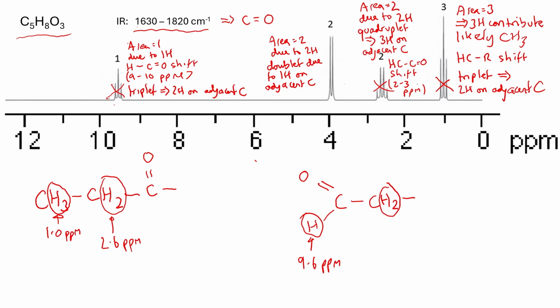But what about its chemical shift? Because what we now need to do is to say, well, how does this bit of structure connect up to that one? And the chemical shift of that's going to be very useful for doing that. If we tried to just join these 2 bits of structure together directly, you could see there would be 2 problems.